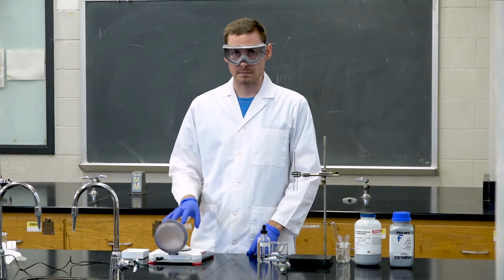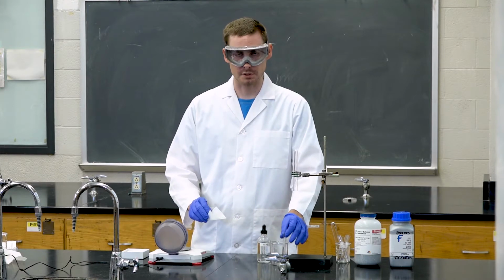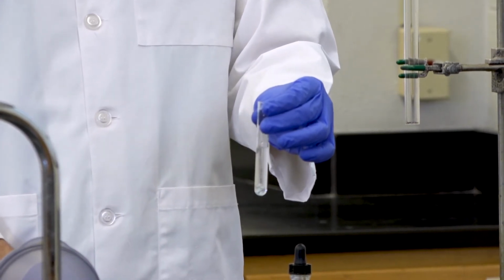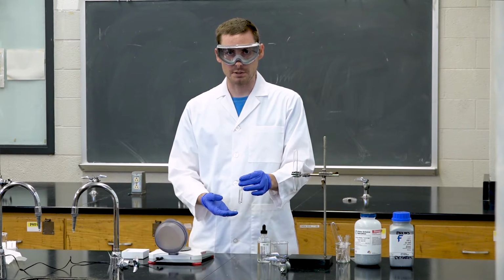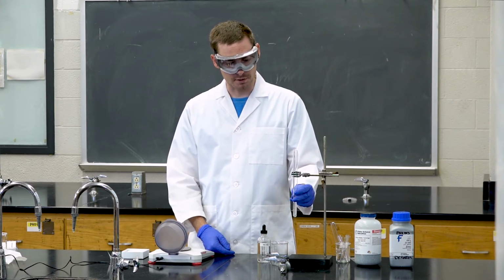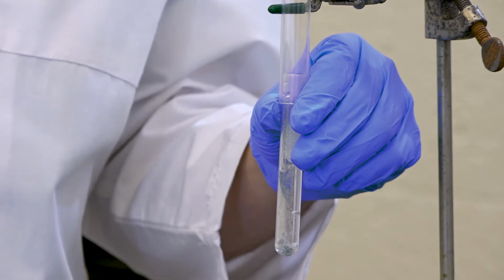Record the mass of the zinc in your lab book and then add the zinc to your test tube with hydrochloric acid in it and observe the reaction. So what's happening is the zinc is reducing the hydrogen in the solution and forming hydrogen gas. If we now put this underneath another test tube, we can collect the gas that is being produced into this test tube, which is hydrogen gas.